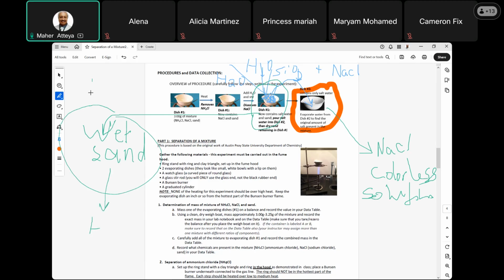This is dish number one. Dish one. Okay, heat, and then I will get dry silicon dioxide, sand.